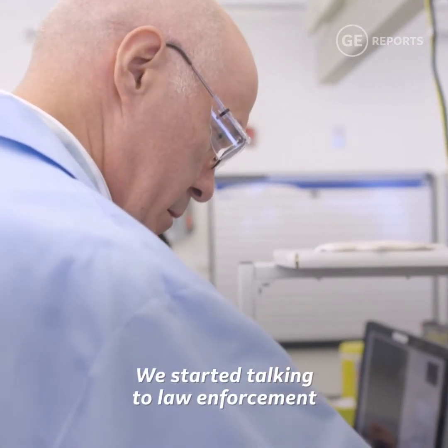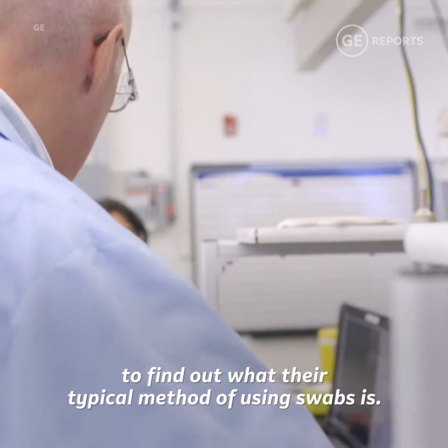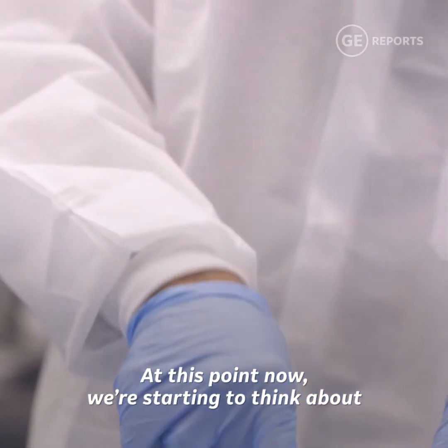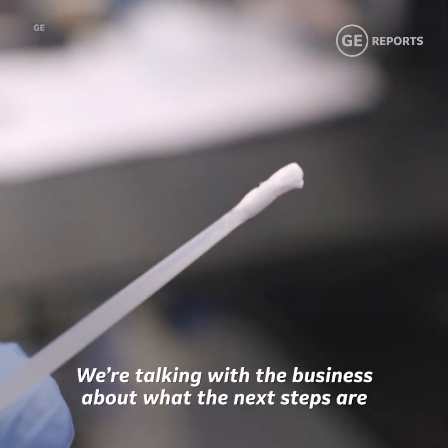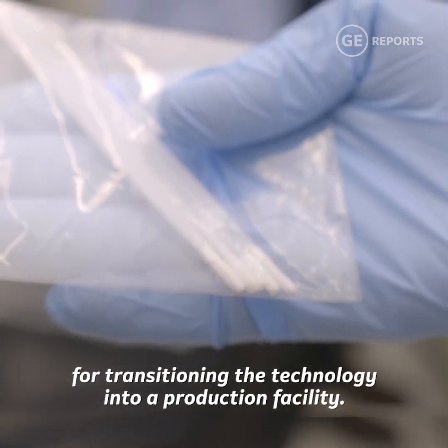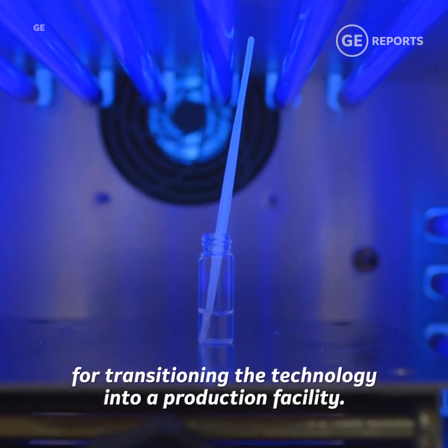We have started talking to law enforcement to find out what their typical method of using swabs is. At this point we are starting to think about how we would commercialize this, and we are talking with businesses about the next steps for transitioning the technology into a production facility.